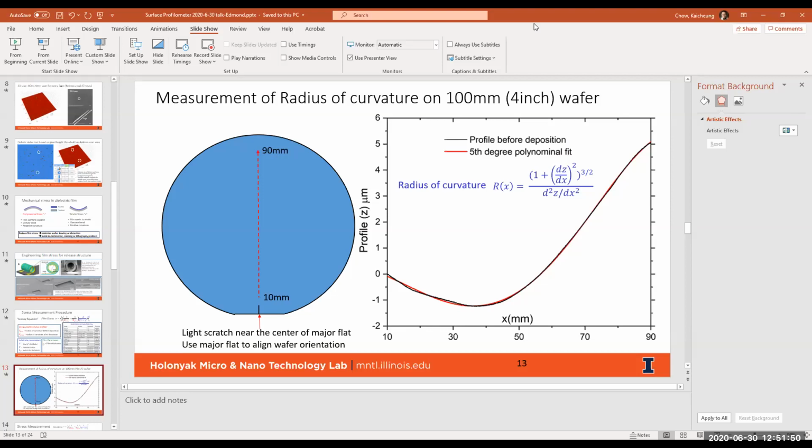So since this is stylus based, that means the stylus is touching the wafer. Is that right? Yes. Have you seen any artifacts indicating that it leaves any kind of residue, alteration, or damage to your sample?